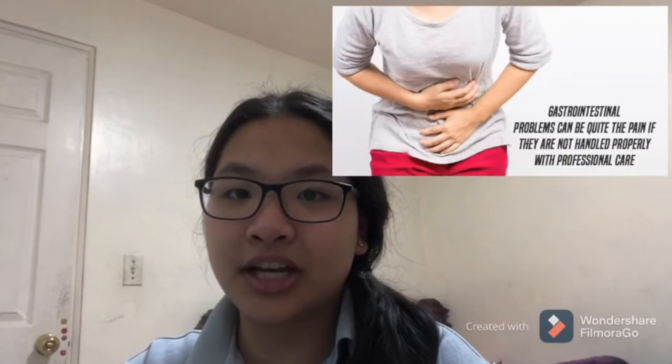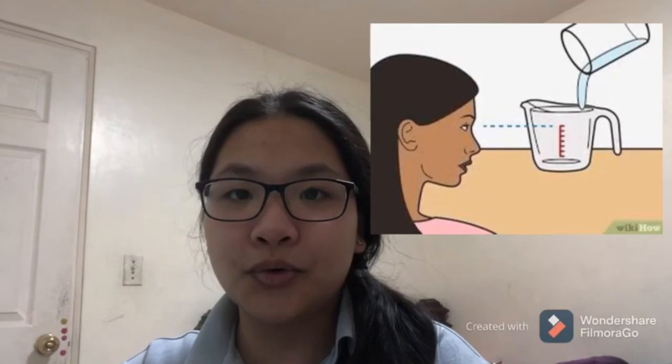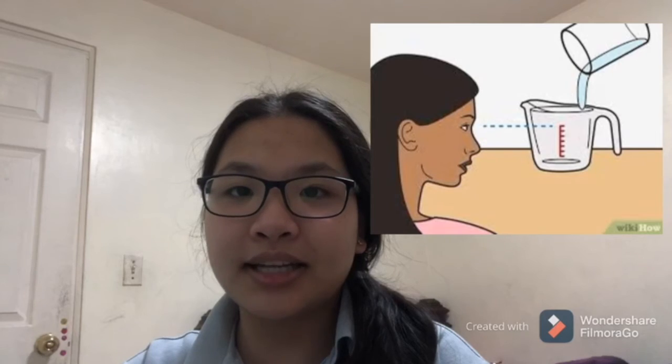Don't ingest because it may cause gastrointestinal irritation with nausea, vomiting, and diarrhea. Don't inhale because it may cause respiratory irritation. Number 5. After the experiment, wash your hands thoroughly. And number 6. When measuring liquids like water and bromothymol blue, make sure you're doing it on a flat, even surface.